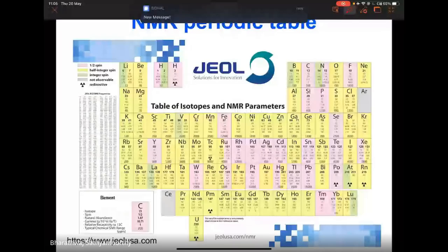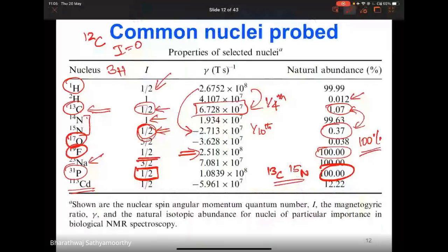That's a good question. So let's take glucose, for instance. When you have glucose, you have something like C12H22O11. By default, oxygen is in 16O, it's an isotope. If you want to study oxygen, then probably the O17 that's present at 0.04% is what you want. Unfortunately, to get a spectrum at natural isotopic abundance takes a very, very long time. As I mentioned, the signal-to-noise ratio determines whether you're able to observe something or not.